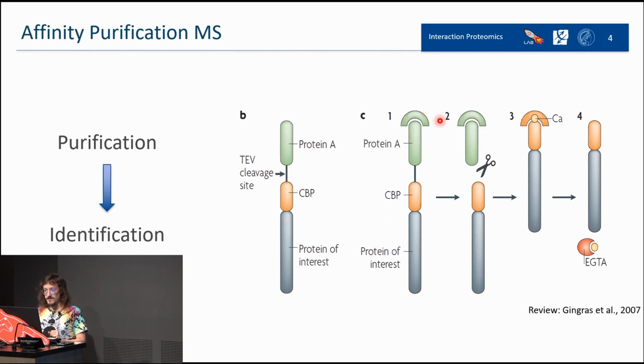And then we have here something that will attach with the maximum reliability possible to protein A. Then we know that this site is the cleavage site, which an enzyme will cut, used afterwards in order to sequence only the protein of interest, the protein that will form the complex with protein A and will attach specifically to this calcium binding part.